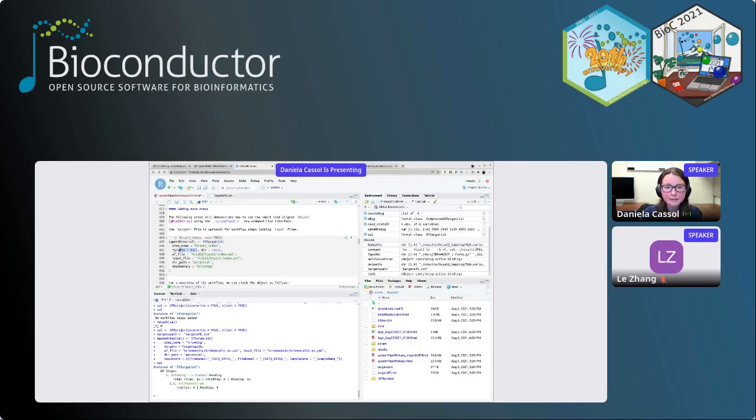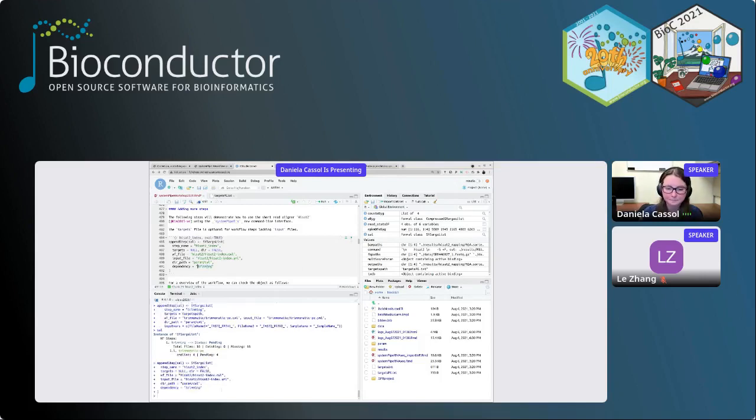So then, as I said in the presentation, the targets can be optional, and in this case we are passing null. And the other thing I would like to highlight is that here I'm defining the dependency. So I'm saying I'm depending on, in this example, the previous step, which is trimming. So you pass the name of that. I'll run that, and now I'll check the object again.